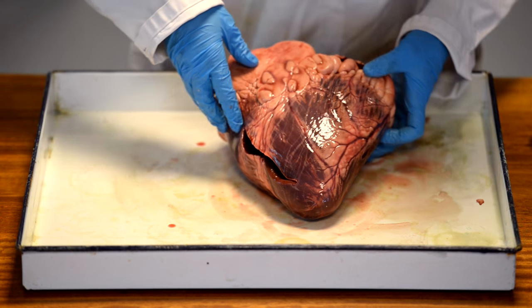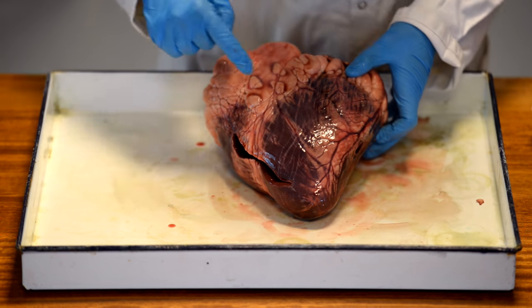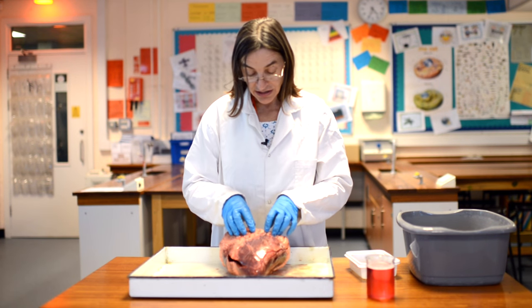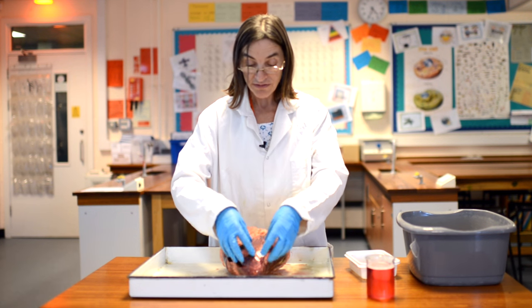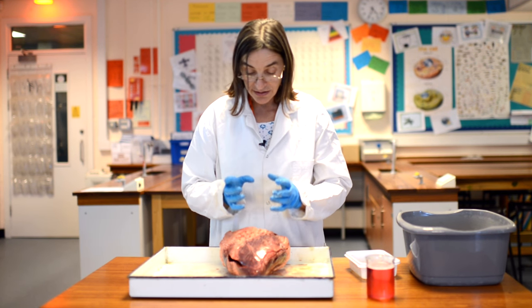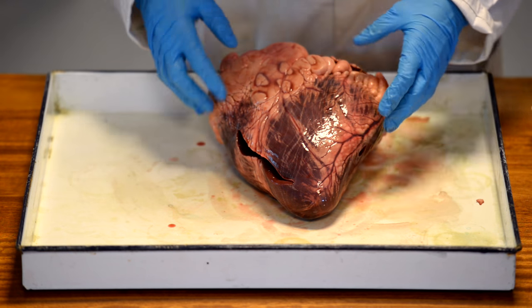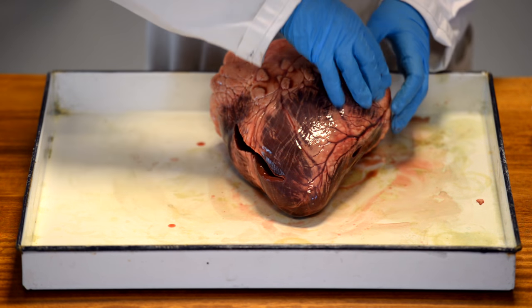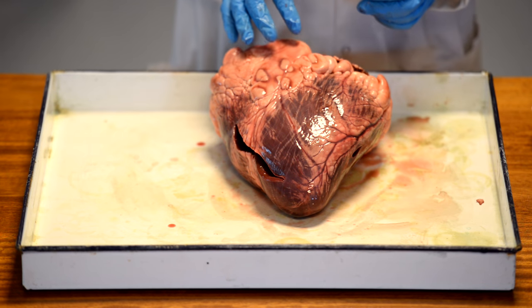And this is a very good point, because if you have a look, there is a lot of fat around these blood vessels which go down towards the end of the heart. What you need to think about is that the heart is a muscle. Because the heart is a muscle, it needs a very, very rich supply of blood to itself so that all of that muscle can contract and it can beat. So the whole of the heart is supplied with blood by these blood vessels, the coronary arteries and the coronary veins, spreading out down to get oxygen right to the very bottom of the heart.